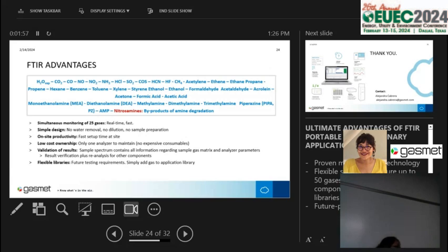What about PFAS, where we need to detect down to parts per trillion? No, that's not doable. Unfortunately, no, we're not there. I don't know if there's more. And then one other question.